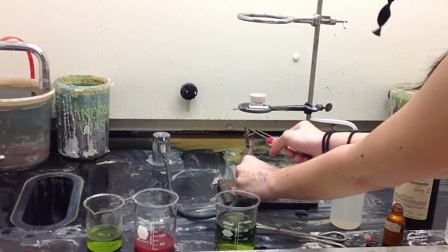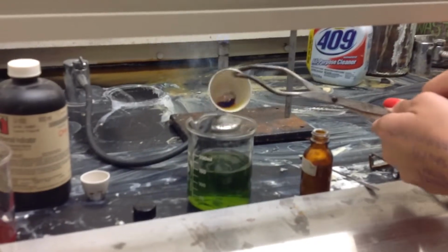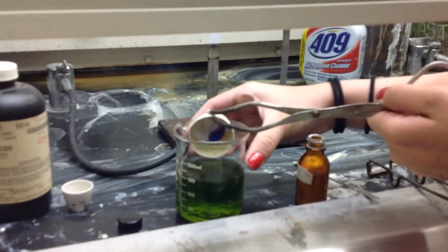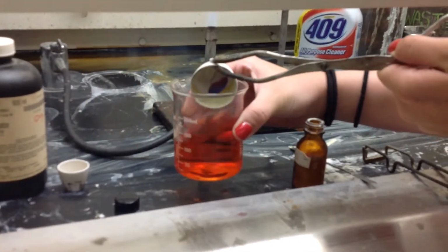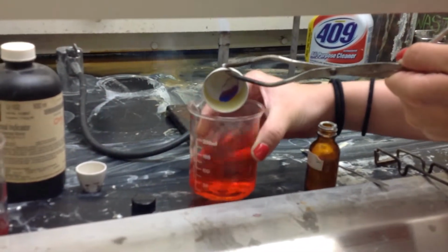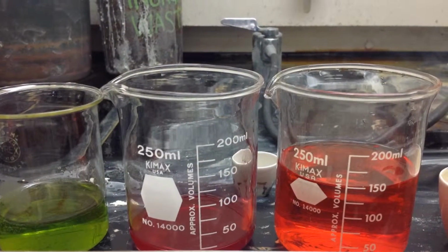Wait until the sulfur is melted into a red-colored liquid, and then use the tongs to hold it over the water containing a universal indicator. Swirl the beaker for a while until the solution changes color. The change from green to red while using a universal indicator means the solution is acidic.